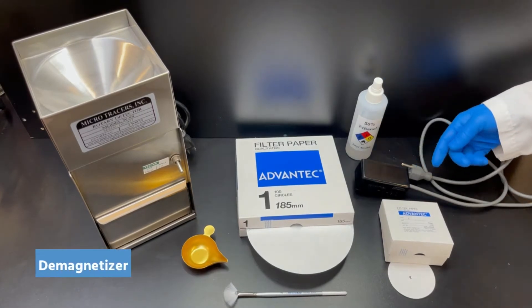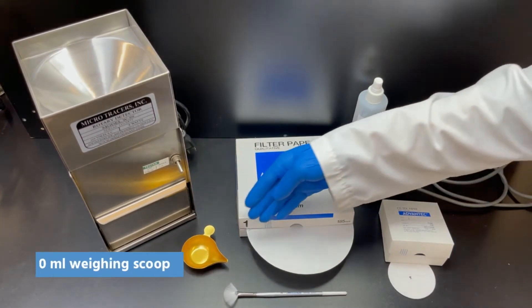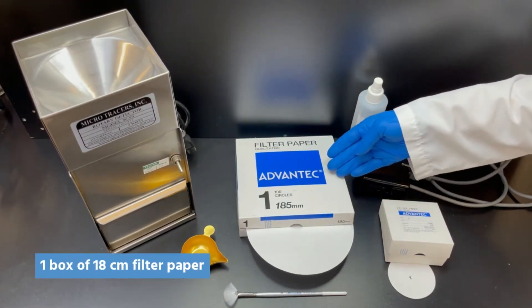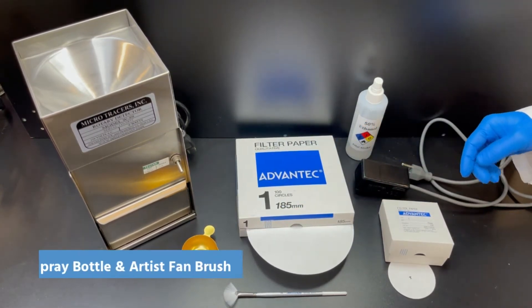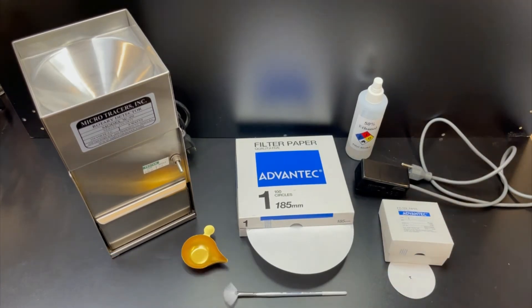Demagnetizer, two boxes of pre-drilled 7.5 centimeter filter papers, a 30 milliliter weighing scoop, one box of 18 centimeter filter paper, a small spray bottle, an artist fan brush, and Microtracer literature and software.